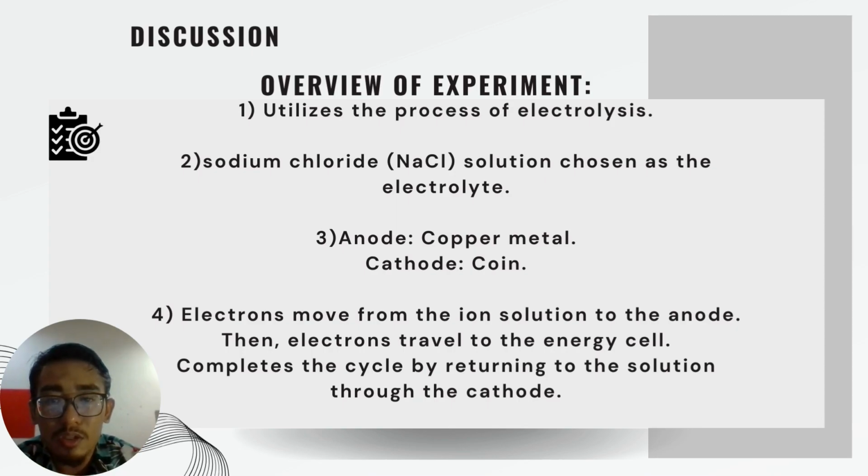And now we will talk about the discussion. First, we will discuss this experiment in general. This experiment used the process of electrolysis to work. Electrolysis is a chemical decomposition process produced by passing an electric current through a solution containing ions.